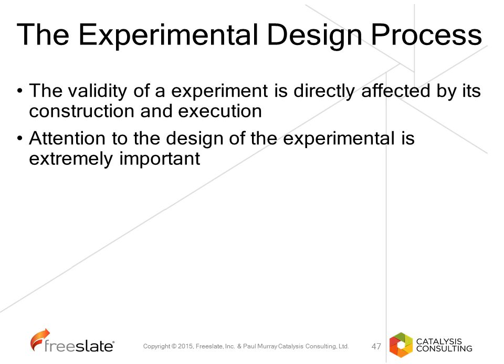To use experimental design properly and effectively, you need to carry this out in a very fixed process. The outcome of the design is directly related to the thought that you put in at the beginning. So you have to construct the design and carry out in the right way. So it's very important that you think about your chemistry very carefully and follow the following steps.